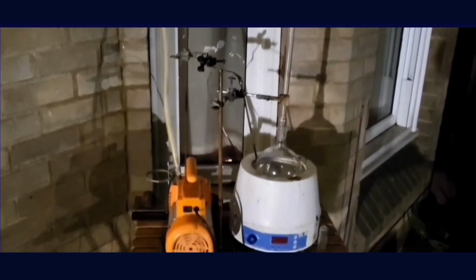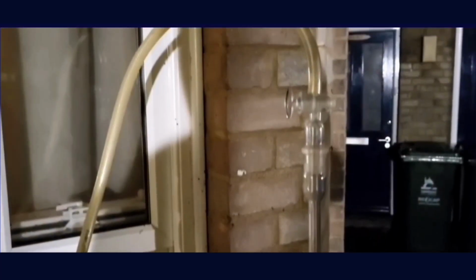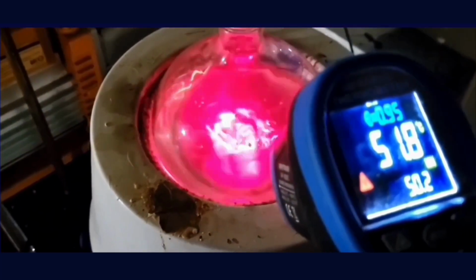Boiling under vacuum is a good idea because you don't want to exceed 100 degrees Celsius. In the real world, the reaction is not as simple as you may think. You get byproducts over hydrolysis. Instead of methylamine hydrochloride, you get ammonium chloride. Careful temperature control, careful measurements and weights serve to limit these losses.